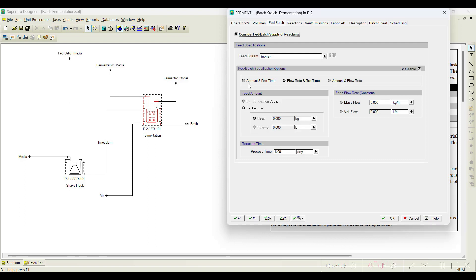You have three options — that is 'amount and reaction time'. For example, if you need to transfer something around 10,000 kg of fed-batch media, you select 10,000 kg here. The reaction time — we know the process time is six days, reaction is carried out for six days. Accordingly this particular mass flow rate is set. For example, if I set it as flow rate and reaction time, it gets activated.